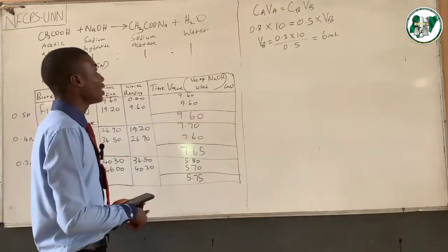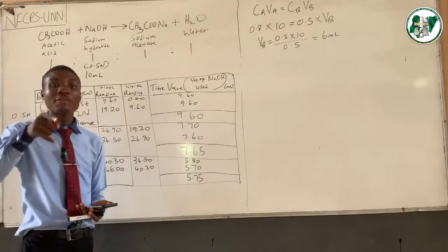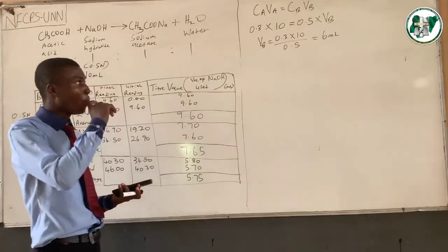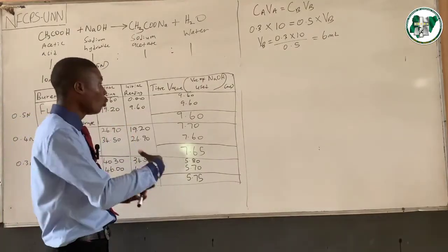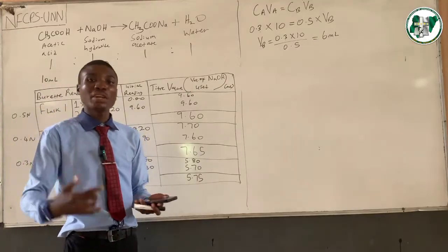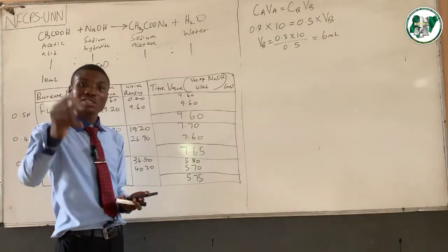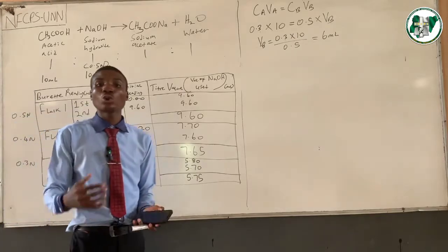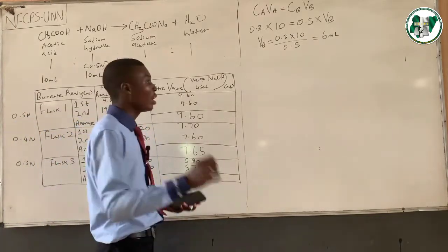So now let us go further and begin to calculate what is necessary for us to fill up the table that you have in your practical manual, so that we can have a very good flow. I will need to do the calculation for the new concentration of the solution where adsorption has taken place. The moment I do that, I will draw the table very clearly for you to see, then we'll begin to fill the parameters in the table, and I will guide you on how you can go about your graph and do very well in your practical examination.